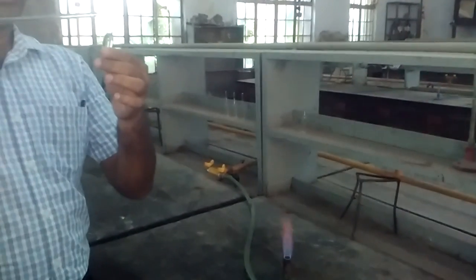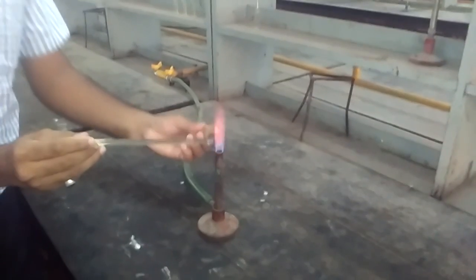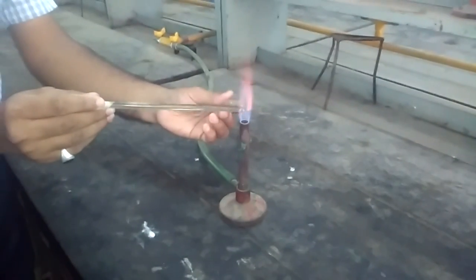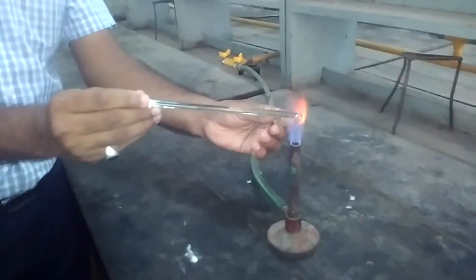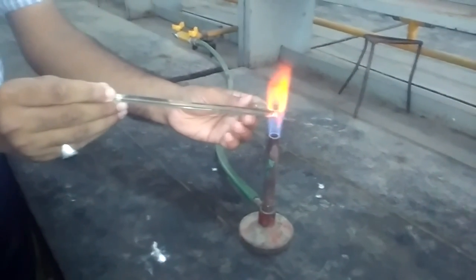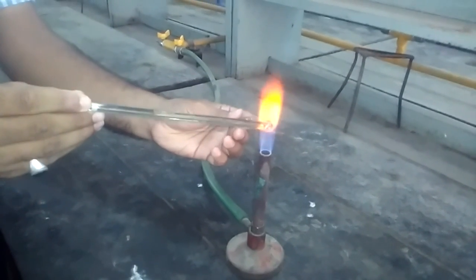The tip of the ampule should not contain any water molecules — it should be completely dry. Now we have to keep both the ampule and glass rod in the frame and simultaneously heat. Keep the ampules rotating during heating.